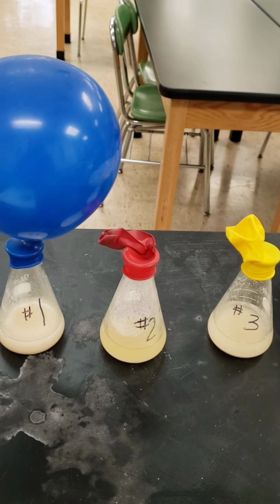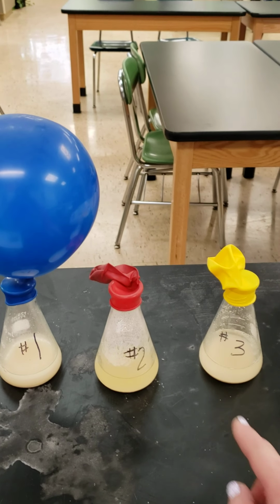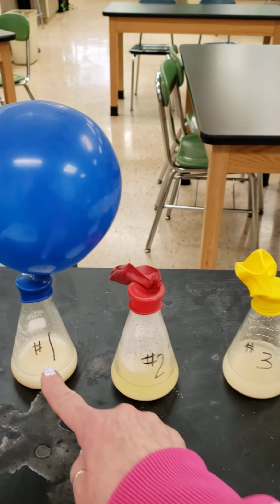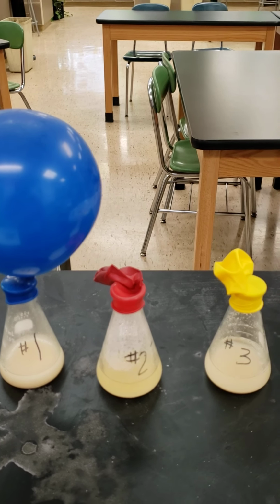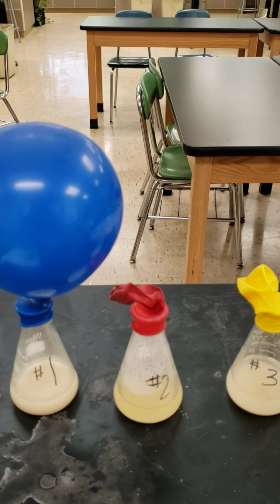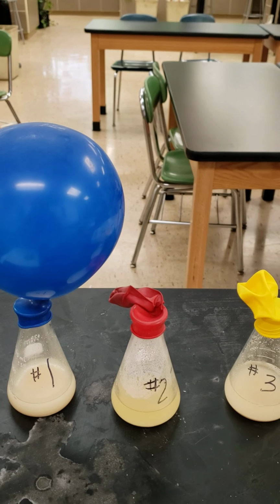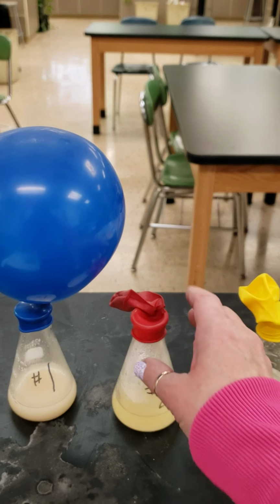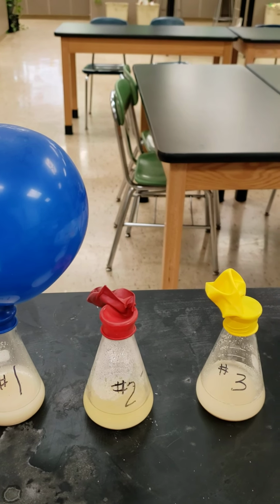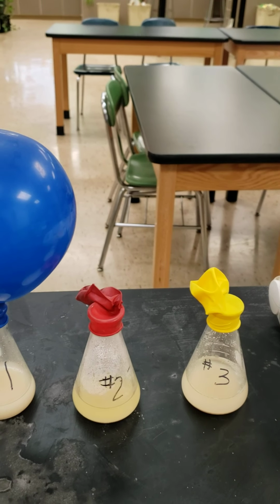So when we look at our 3 flasks here, each flask had 50 milliliters of distilled water. Each flask, 1, 2, and 3, had 2 grams of yeast. Flask number 1 had 2 grams of sugar. Flask number 2 had 2 grams of sugar, but flask number 2 I boiled for 2 minutes. Flask number 3 had no sugar, just the yeast.